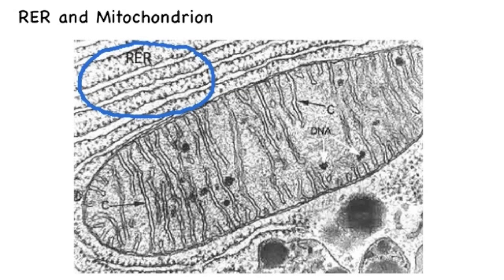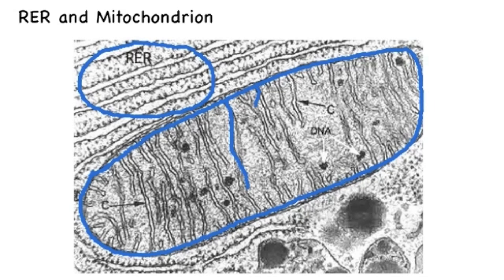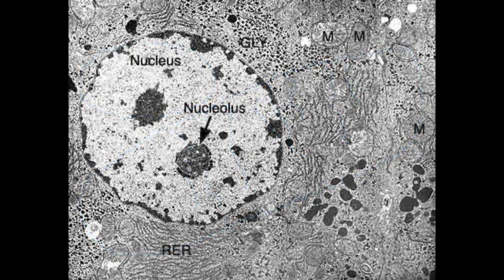In this image we can once again identify the region of the rough endoplasmic reticulum by its association with ribosomes, but the larger organelle present here is the mitochondrion. We can see the lines that we previously represented on our diagram — the internal compartments formed by the inner membrane of the mitochondrion.